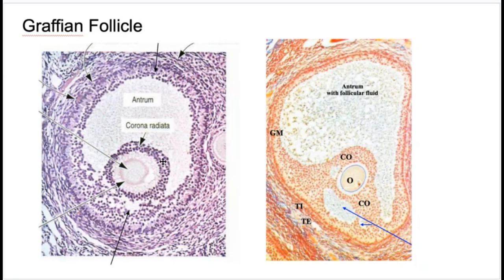follicle. The follicular cells are all going to be moving to the side, right, to make space for the antrum, but they're also going to still be surrounding the oocytes. And so it creates this kind of crownish structure around the oocytes, and this is known as the corona radiata. And another thing is the oocyte is still going to be connected to these follicular cells through a stalk, which you can't really see here, but you can see here. This stalk, which is still made up of the follicular cells, is called the cumulus oophorus.